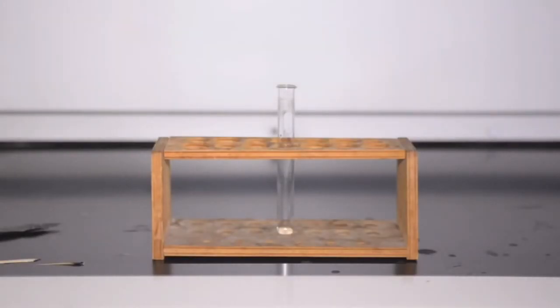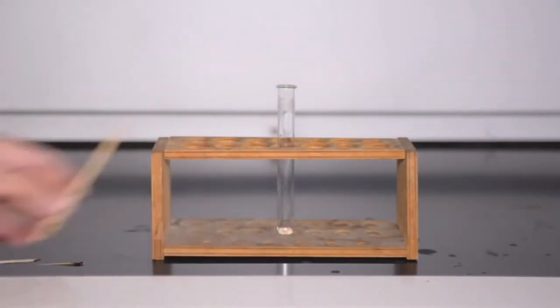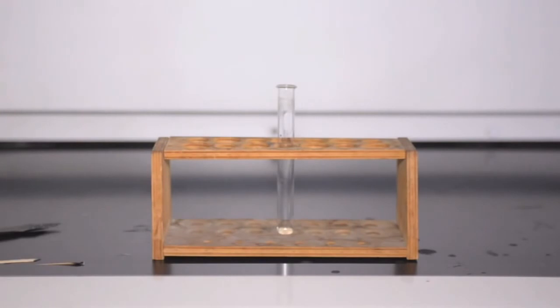During Reactions 4 and 5, splint tests will be used to detect the presence of hydrogen or oxygen gas. These tests are performed with the help of a thin, dry piece of wood, the splint. The splint is either a glowing splint or a burning splint, which we will demonstrate.